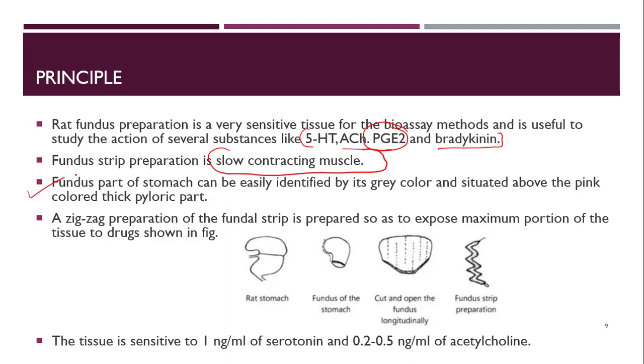The fundus part of the stomach can be easily identified by its gray color, and it is situated above the pink colored thick pyloric part. A zigzag preparation of the fundal strip is prepared so as to expose the maximum portion of the tissue to the drugs, which is shown in this figure.